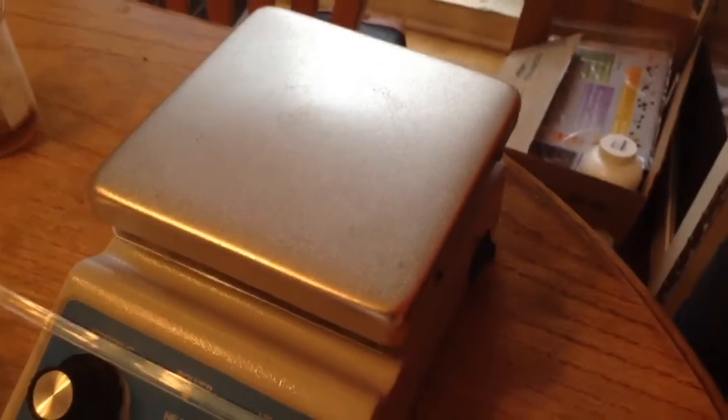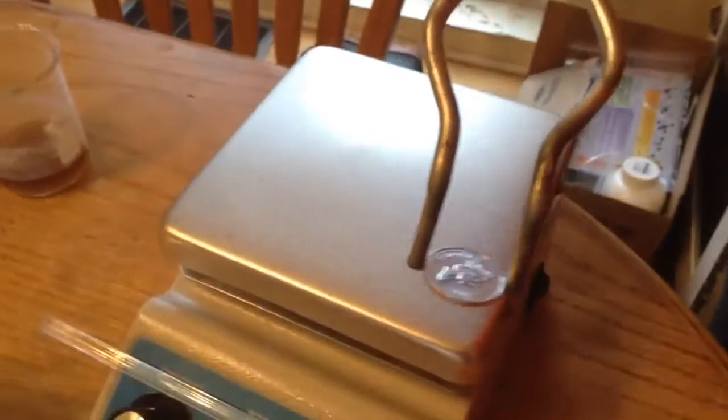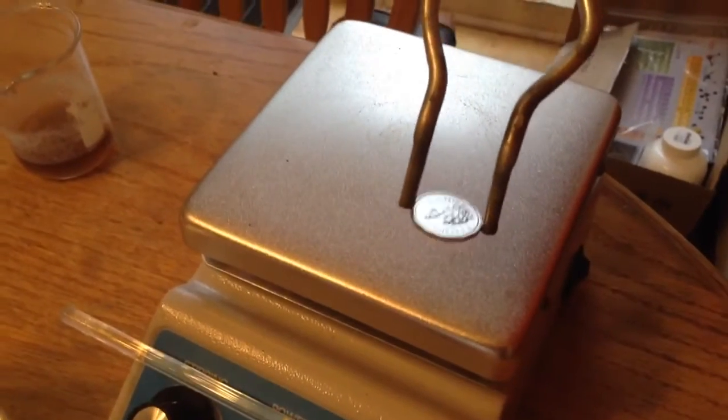So this is our second penny. We're going to try to toss it on — we've heated up the hot pad even more. It's much, much shinier than the other one, so we'll give it a go.